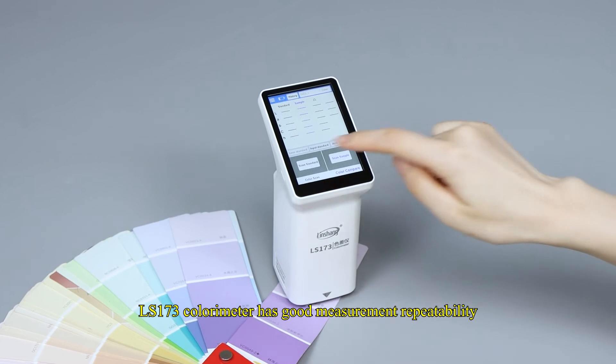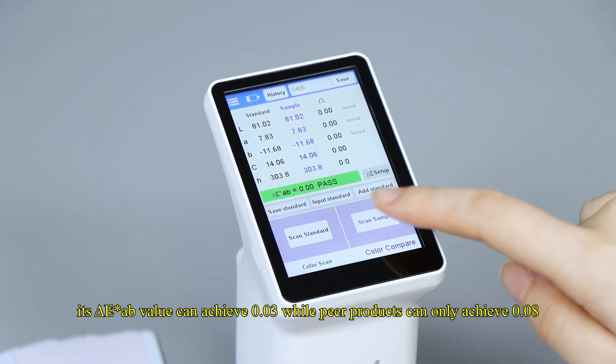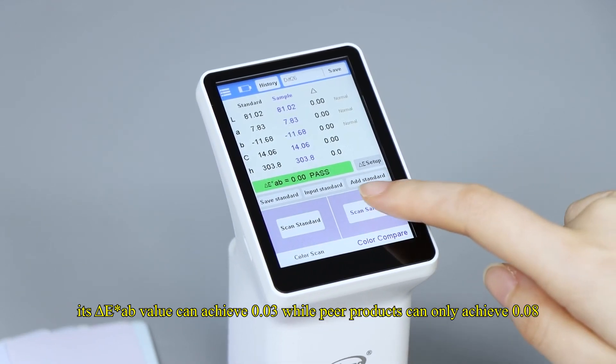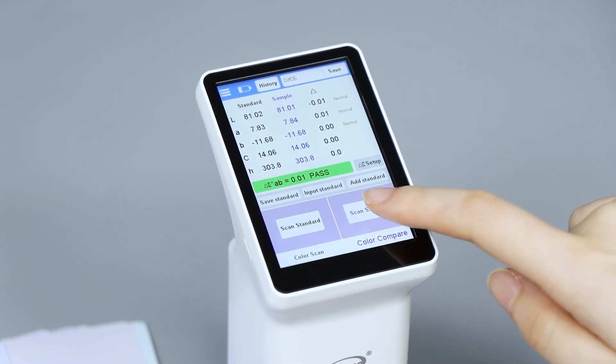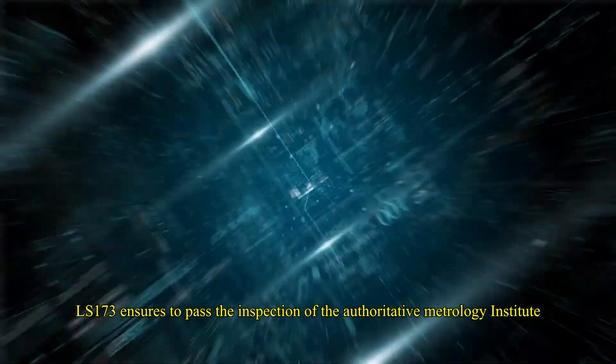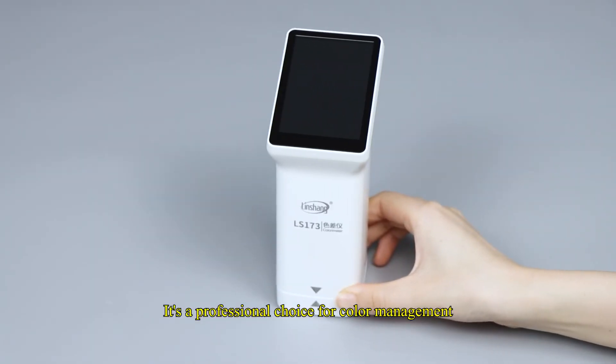LS173 colorimeter has good measurement repeatability. Its delta EAB value can achieve 0.03 while peer products can only achieve 0.08. LS173 ensures to pass the inspection of the authoritative metrology institute. It's a professional choice for color management.